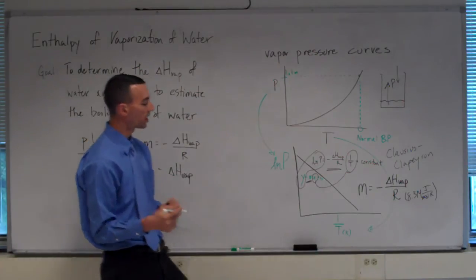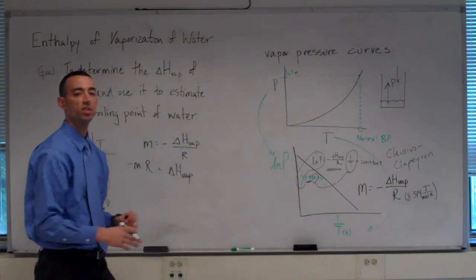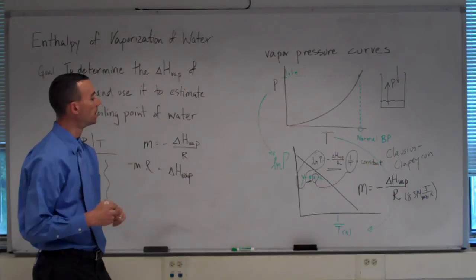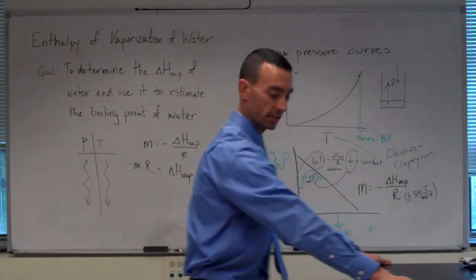We can ignore the other piece of this graph's equation. It's just a constant. It's going to be unique to the specific material that we were working with. It's not part of our calculations at all. So how will we accomplish this goal? It's quite simple. I'll wheel in the setup that we're using today.